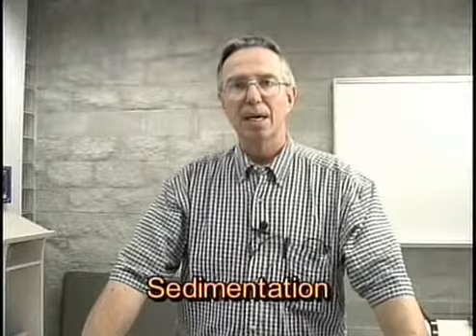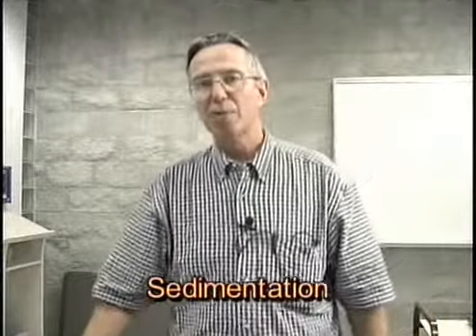In an earlier lab, we learned how to determine the texture of a soil by feel. In this lab, we're going to be taking a soil sample and determining the textural class of that soil based upon sedimentation. Now, in your packet you have a lab handout entitled Soil Texture, Density, and Porosity. Today we will be completing part 1 of this lab, which is soil texture.